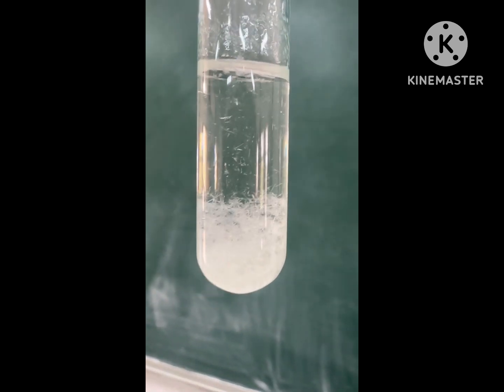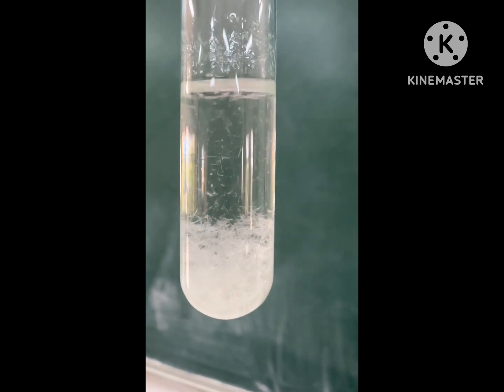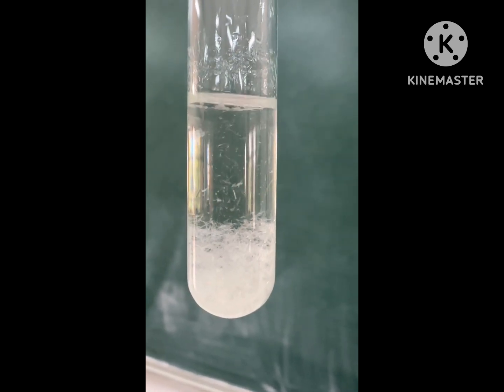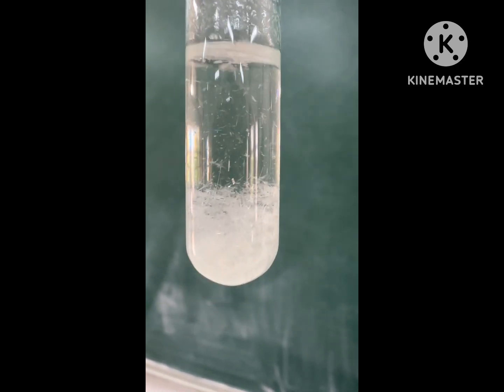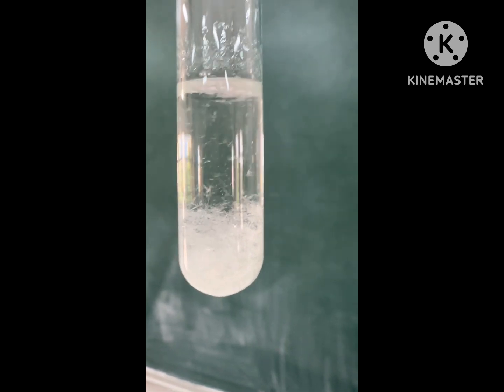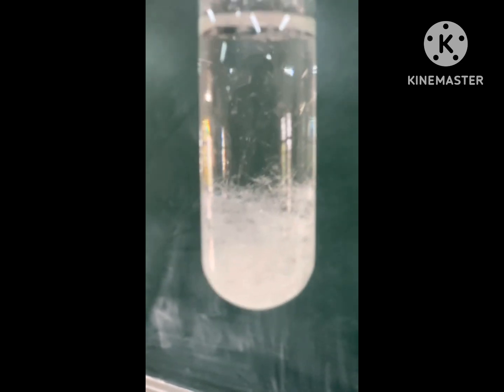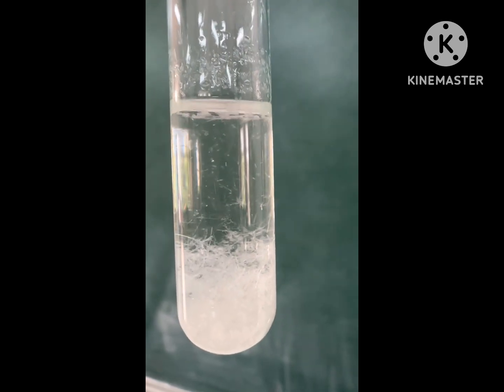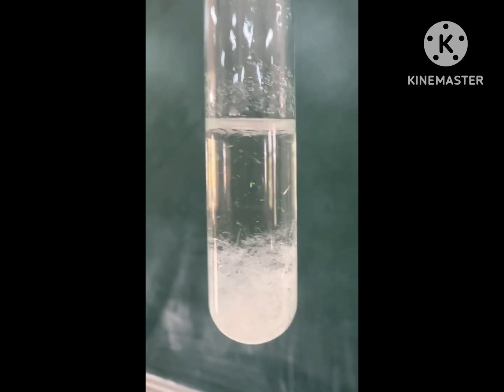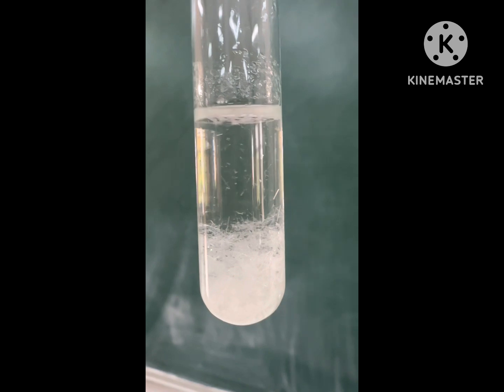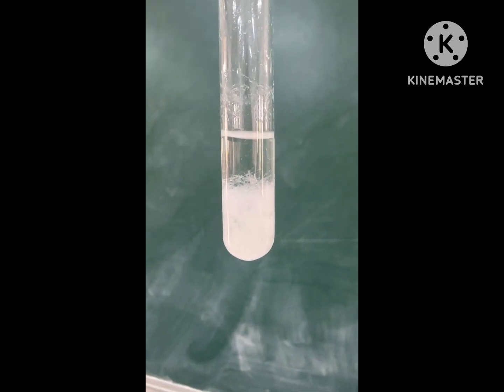So now from the reaction we have got dimethyl fumarate, the trans isomer, which is a white solid. So this reaction demonstrates cis-trans conversion. The cis dimethyl maleate in presence of sunlight and bromine has now converted to trans isomer. The cis isomer was a liquid as we have seen in the beginning of the video.